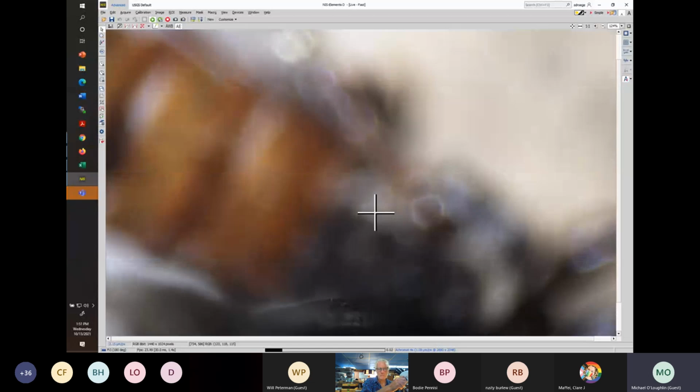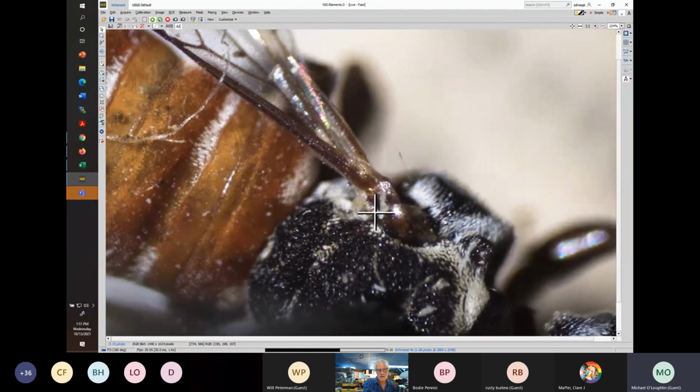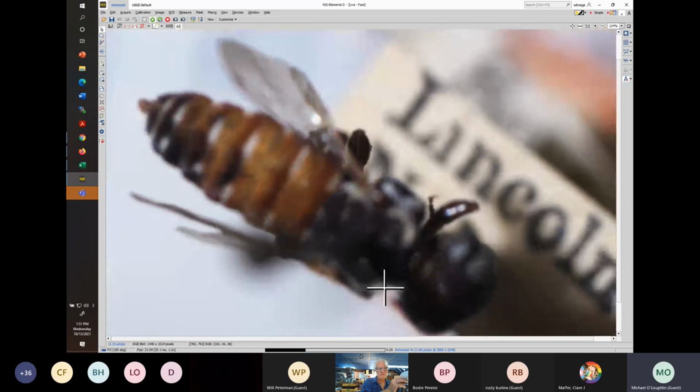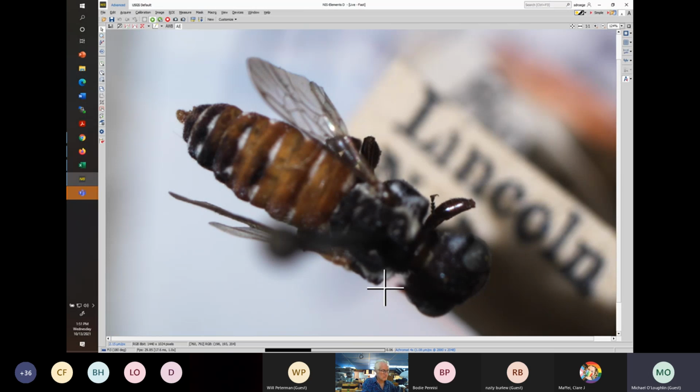Here we can zoom up a little bit more. We'll see we don't have axilla poking out. The presentation is really indicative of Holcopasites. When you look at that after looking at a few pictures, you would recognize it right away. The problem would be maybe dismissing this as a wasp in your collection. So here is the scutum up here, and here's the axilla, but it's tucked in with the edge of the scutellum. And then the male can be told by that pygidial plate.